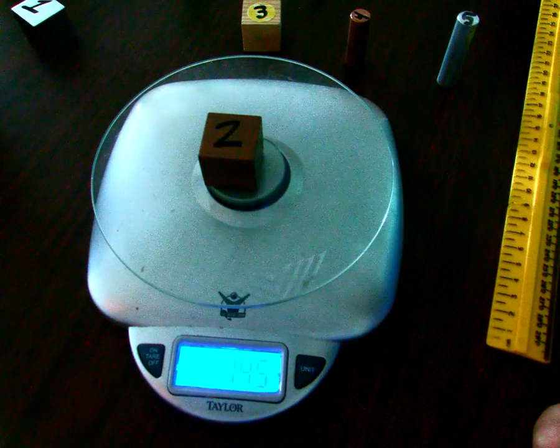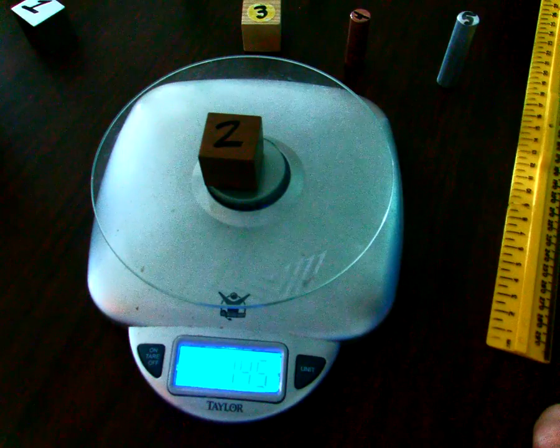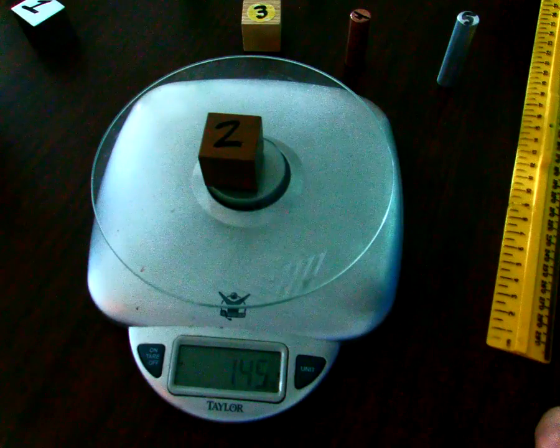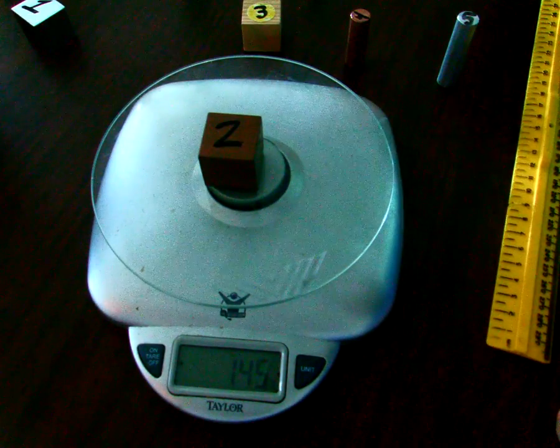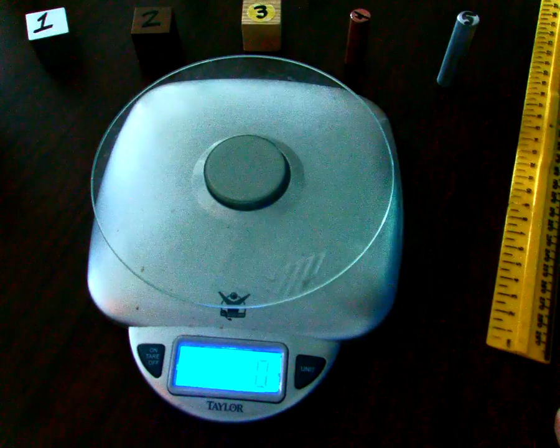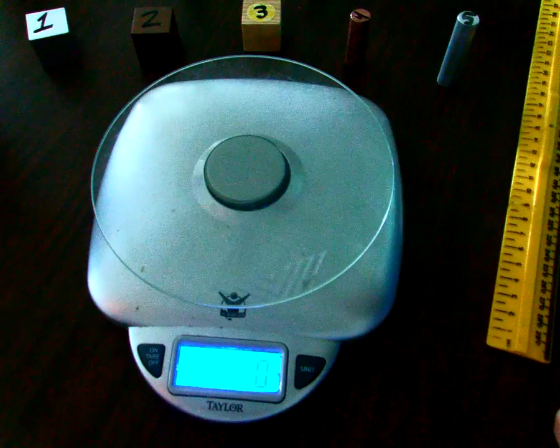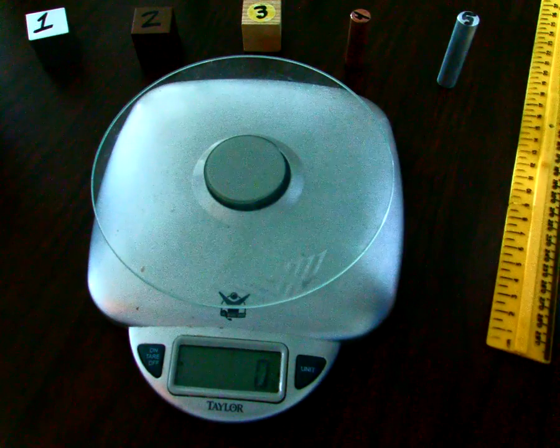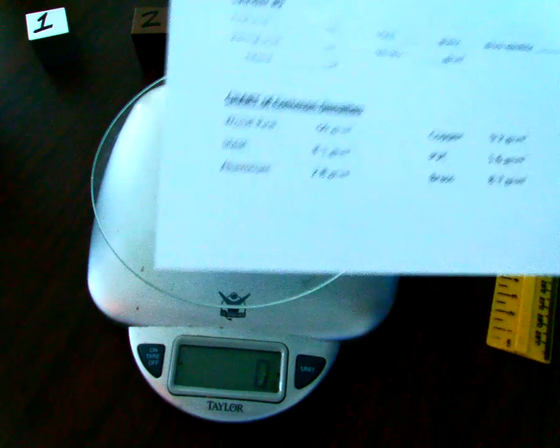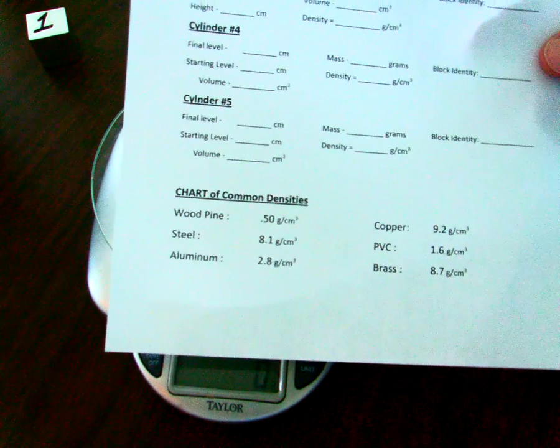Looks like block number 2 is going to come in at 145 grams. So go ahead and write that down if you would. Block number 2, 145 grams. So at this point, you should have your mass for block 2. You should have your volume for block 2. Go ahead and calculate your density. Give you a second to do that. And then take a look at your chart of common densities to see what material block 2 is made out of.